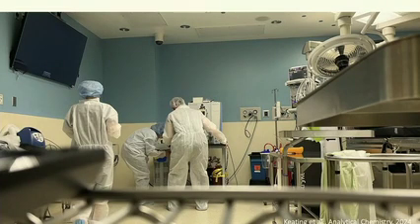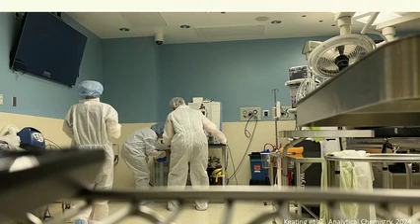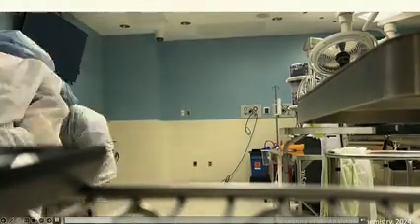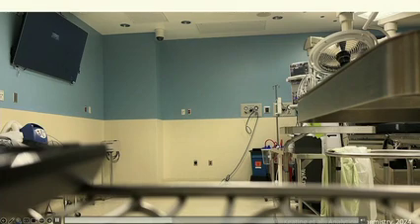There are a lot of applications popping up within the surgical room, and this is one of the recent publications where the authors took an Orbitrap mass spectrometer, not adapted for ambient ionization in any way, and just took it across the hospital, passing through different rooms and corridors, exposing it to different environmental conditions. What they saw is that the signal stays the same, the mass deviation stays the same, and it's actually applicable as such to be used in a hospital.